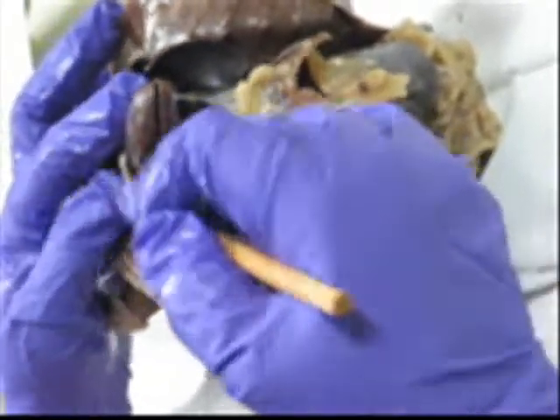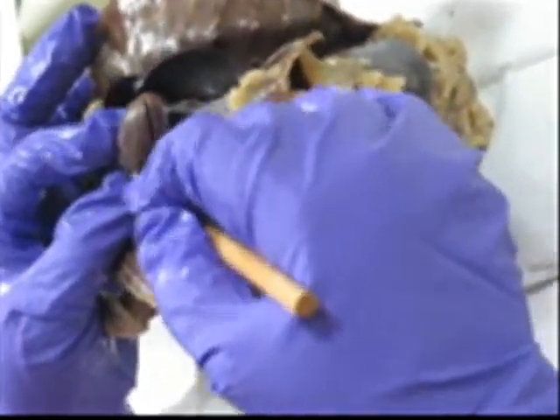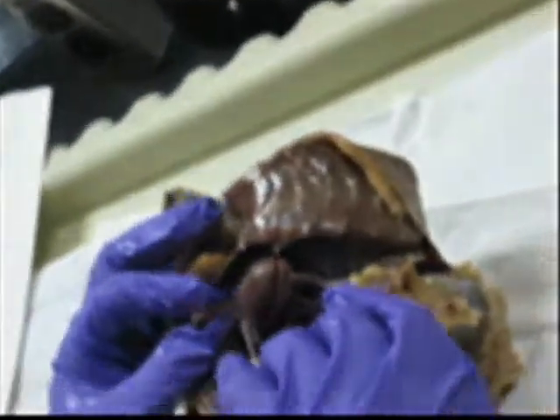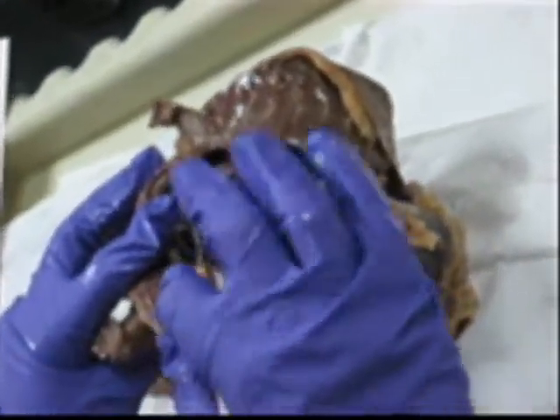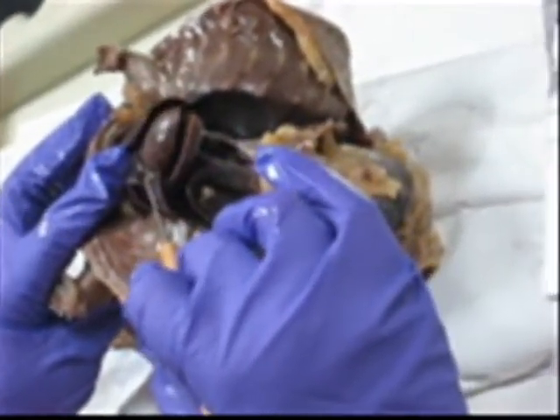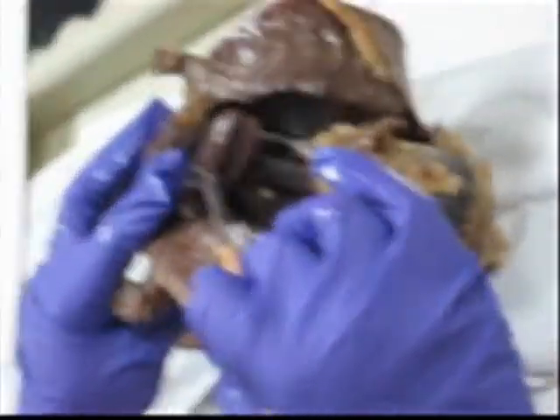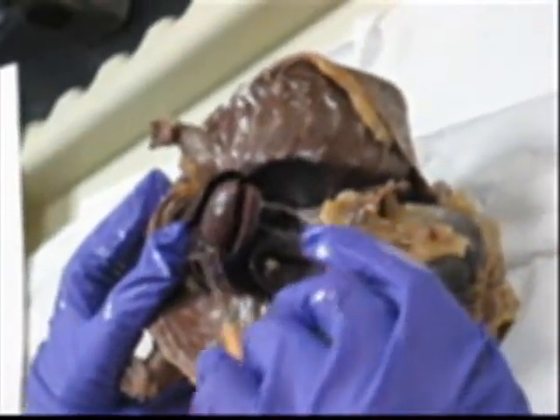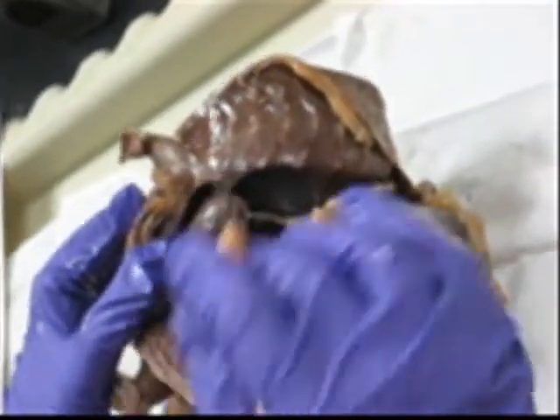On the outside of the heart, just like in us, there is an extension — an ear-like appendage. Do we remember the name? That's the auricle. This is the right auricle.